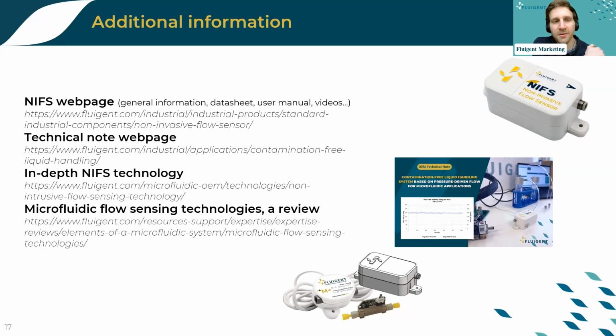Also, we have a review on the technology of the system, which explains how the technology works in more detail. And finally, we have a very nice review that explains all of the flow sensing technologies that are available for microfluidics. If you want to have a complete overview of all the flow sensors available, that's a very good review.